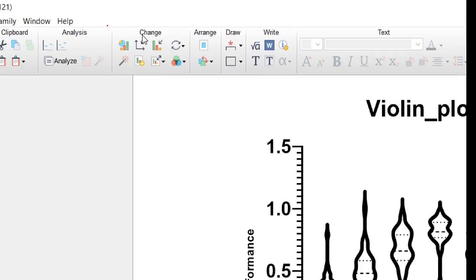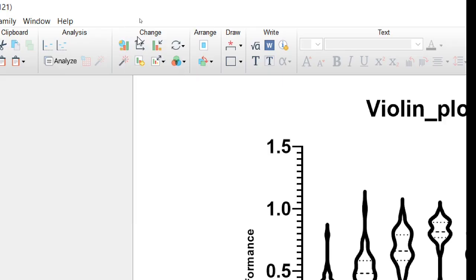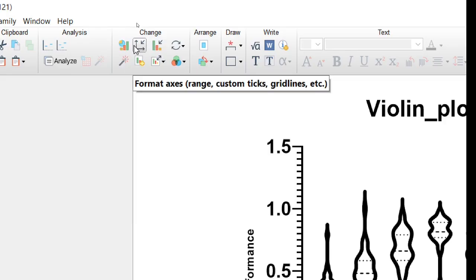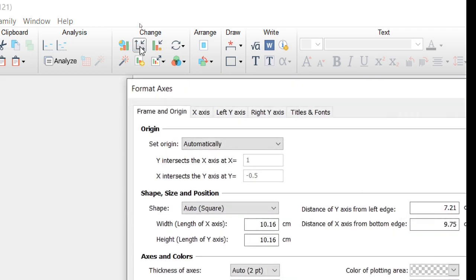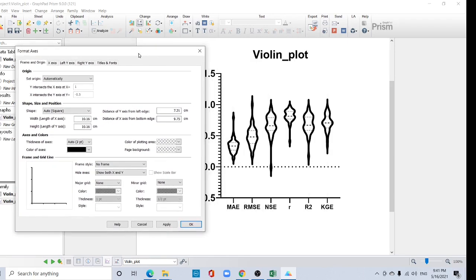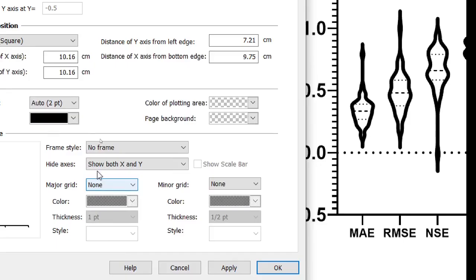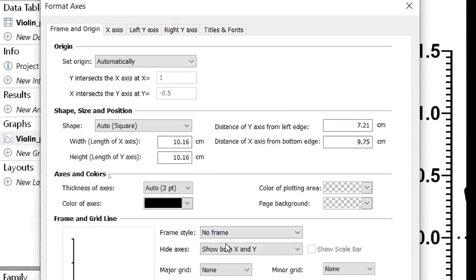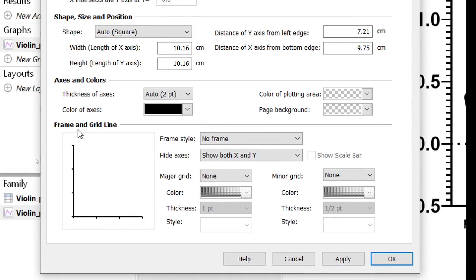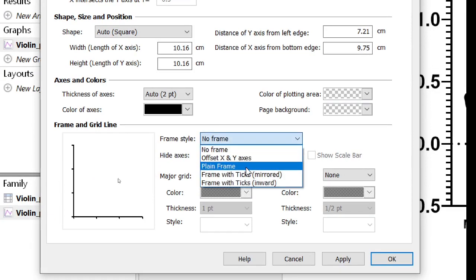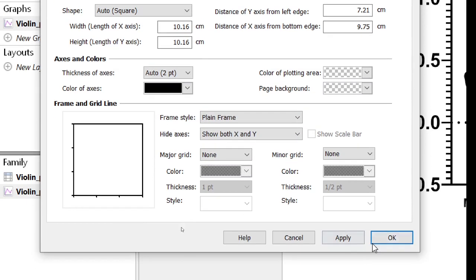This is a graph section. Okay, you should focus only this. There is a format that exists, click here. Now this interface will be open. You can format like I want to give a frame, just go to here, the frame and origin. Now frame and grid line. Here are various options of frame. I want to choose plain frame and apply. Then it will appear like this.